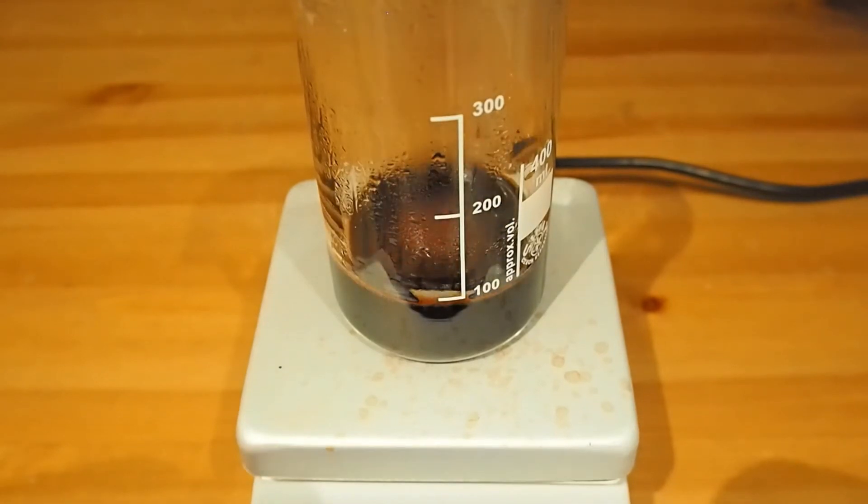So we'll turn the heating off and keep it stirring so that it can cool slowly down to room temperature. We don't want anything burning on the bottom. Let's keep the stirring on and let this cool down slowly.